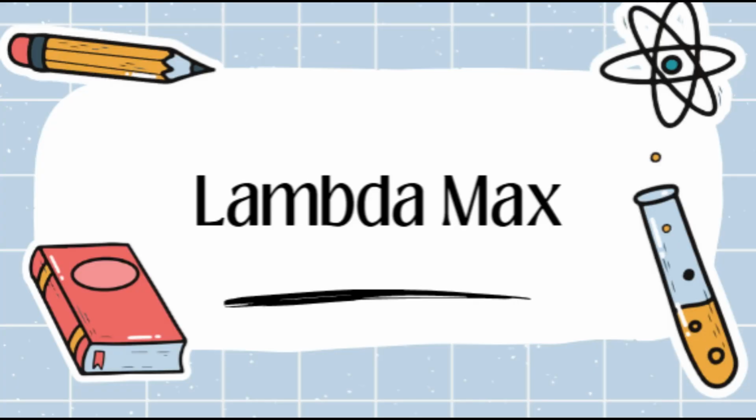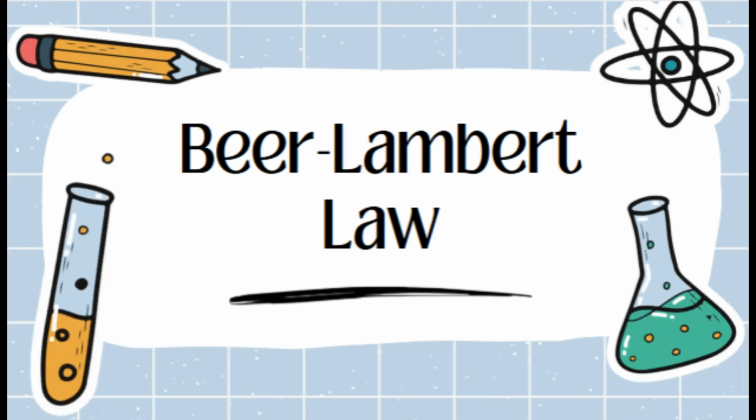Lambda max is the wavelength of light that a substance absorbs the most. In this experiment, the lambda max was at 545 nanometers. The Beer-Lambert law helps us understand how much light a solution absorbs.